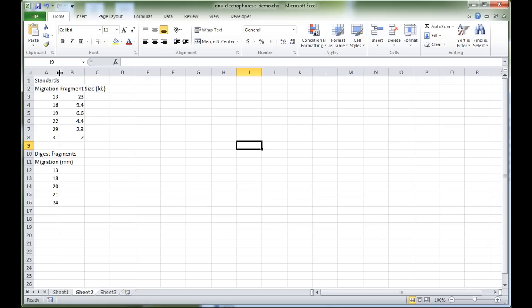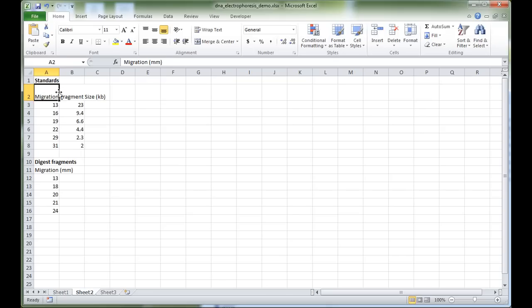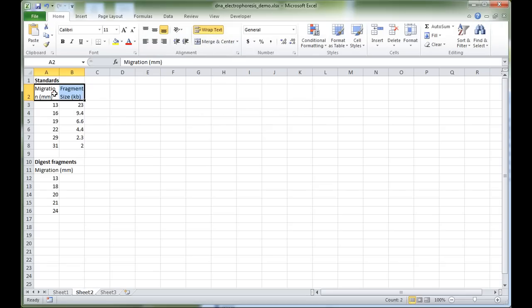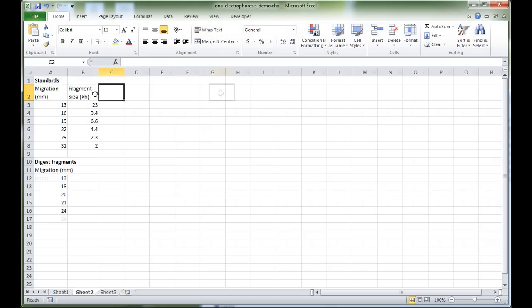Going back to our Excel sheet, let's rearrange a few things. I recommend putting 'standards' in bold. The migration in millimeters column isn't showing because the column is too narrow — we can either extend the column or make the row taller by dragging between rows 2 and 3. We can also select these rows and use Wrap Text so that the text fits within the cell.